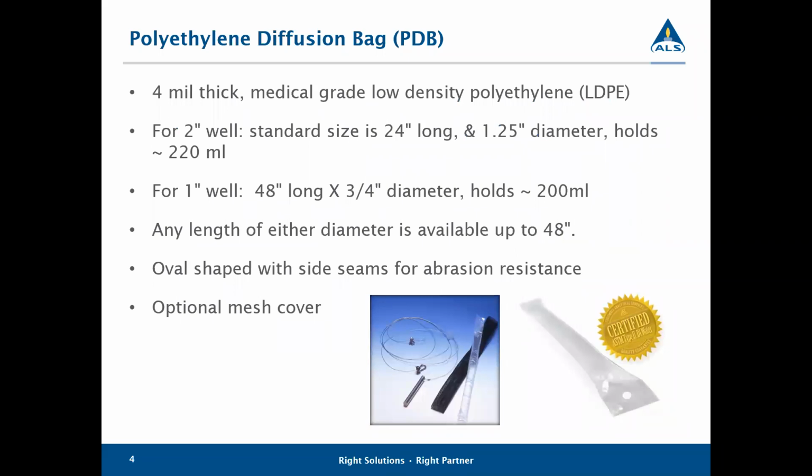So passive diffusion bags, PDBs for short, they're polyethylene tubes or bags. They're filled with analyte-free DI water. PDBs are hung in monitoring wells for periods of at least 14 days or until equilibrium is complete between the contaminants in the bag and the surrounding groundwater. PDB operates by diffusion of contaminants across that polyethylene membrane with no purging necessary.